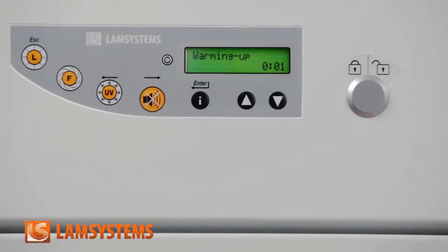During this period the following processes are on: control system, primary heating, air flow sensor calibration, and fan adjustment. The audio-visual alarm system is also on.